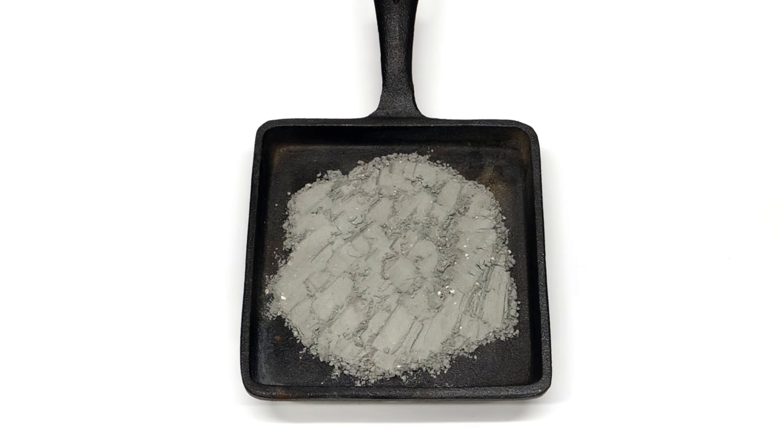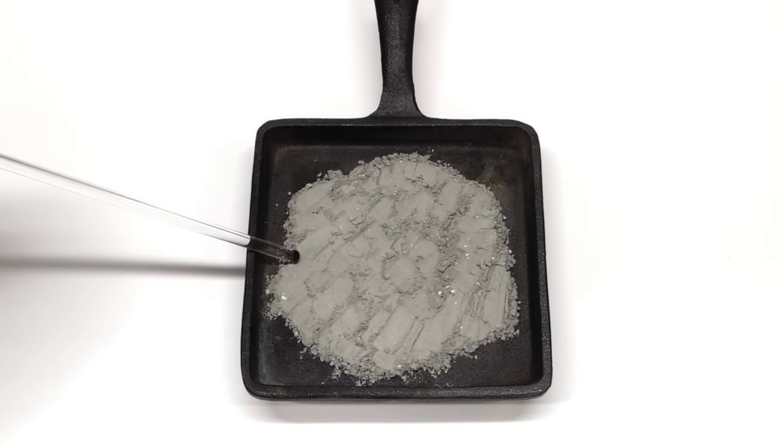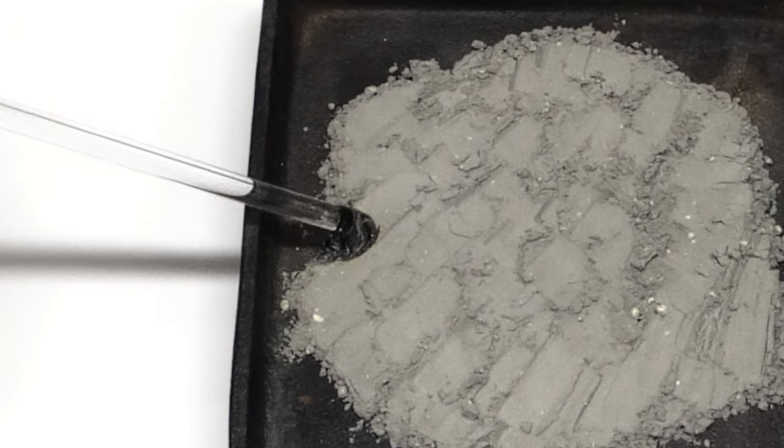At this point it's basically ready, and I just have to light it on fire. The classic way to do this is by touching it with a hot glass rod, but I apparently didn't heat it up enough, and it failed.